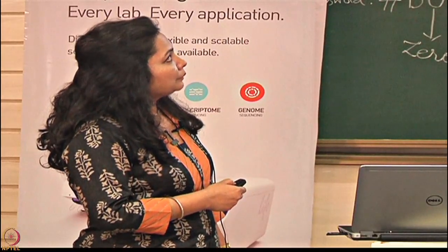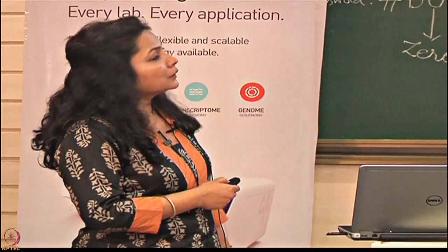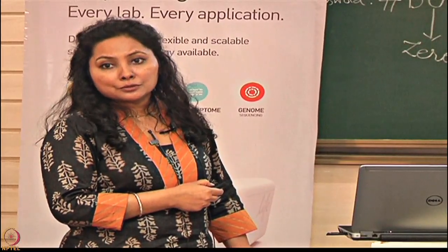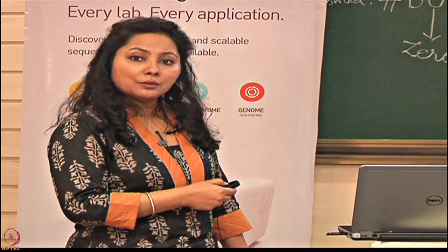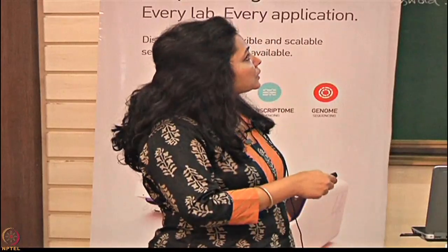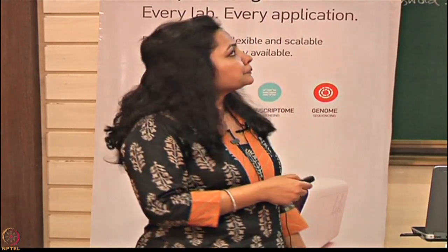Then comes the template preparation. Now as we discussed, during template preparation you are loading these library molecules onto the ion spheres, and then finally these ion spheres are loaded onto the chip. Now these loaded chips you take from here and you just load them on this system and they are good to go for sequencing.